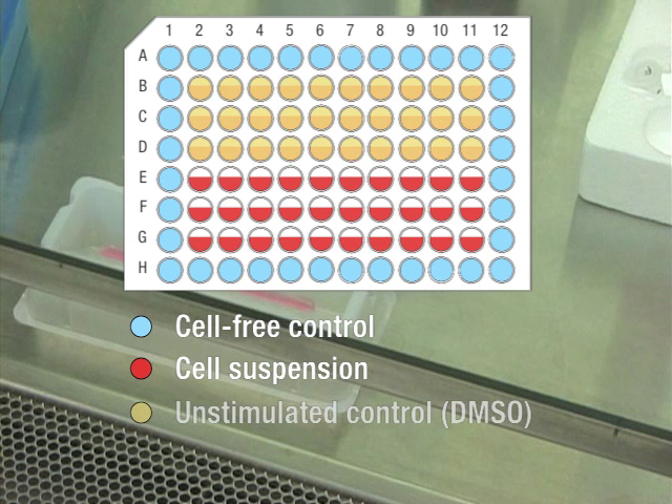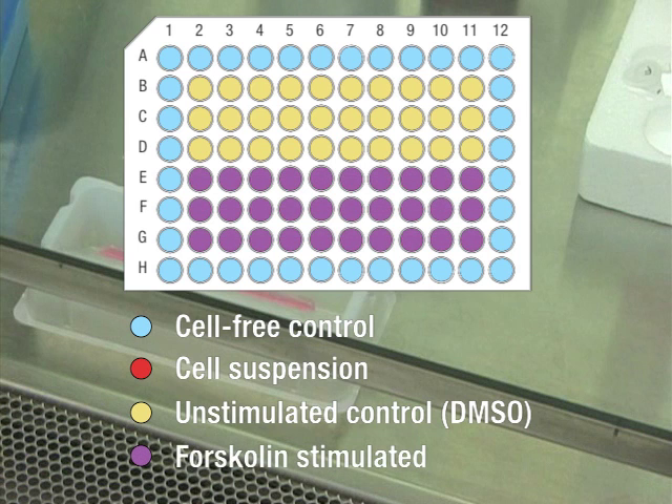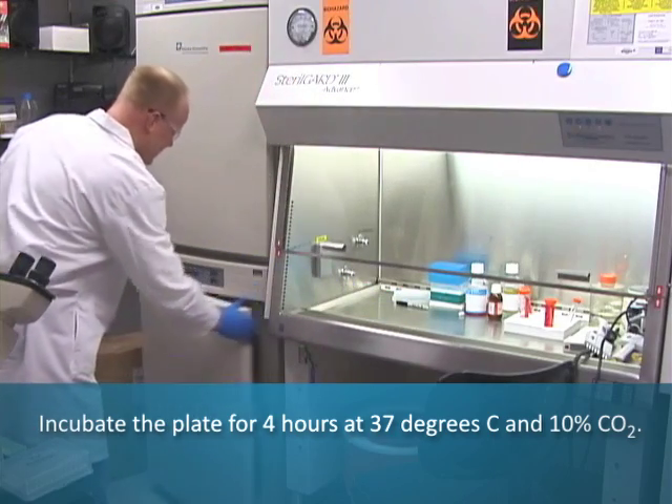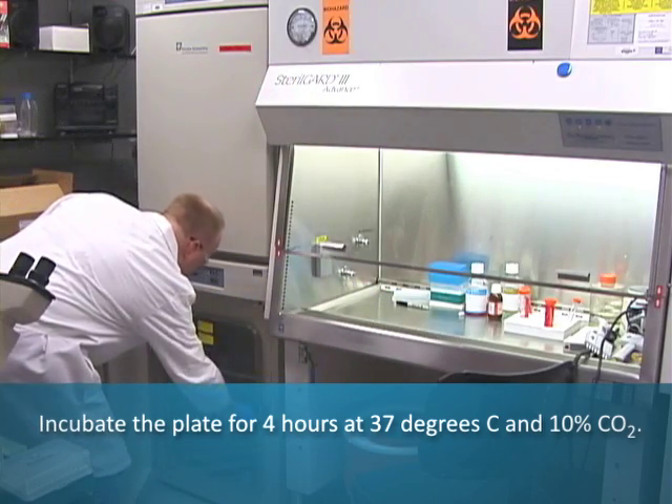10 microliters of DMSO solution were added to half of the wells as an unstimulated control, and 10 microliters of forskolin solution were added to stimulate the cells in the remaining wells. The plate was then incubated for four hours at 37 degrees centigrade and 10% CO2.